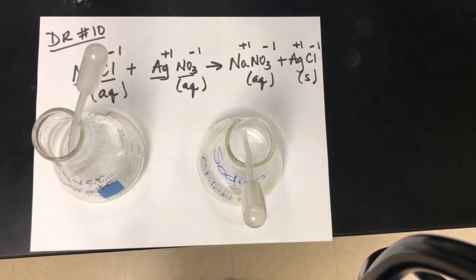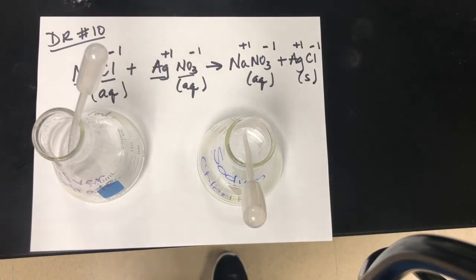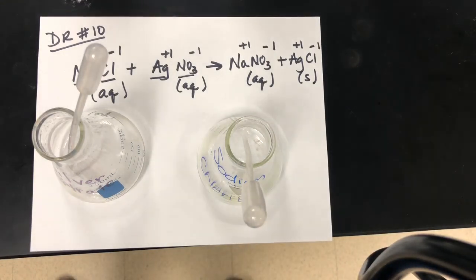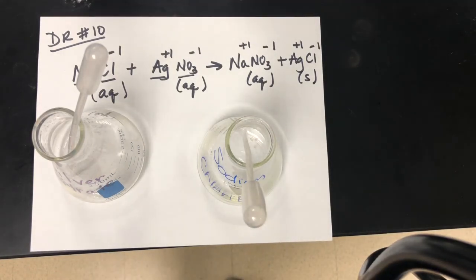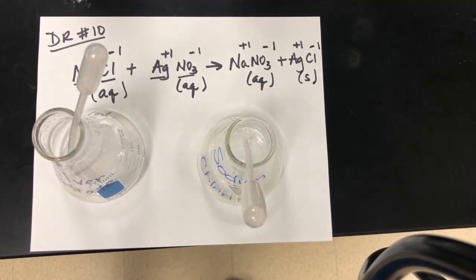Remember that if bubbles are formed, that's called effervescence. If the reaction feels cooler, that's called an endothermic reaction, and if it feels hotter, that's going to be an exothermic reaction because it's releasing heat. So this has been your single replacement and double replacement reactions.